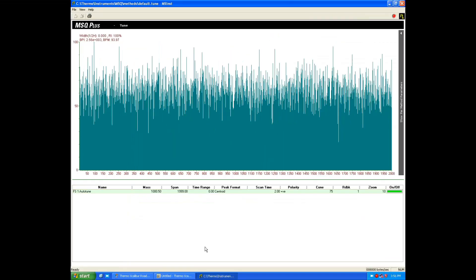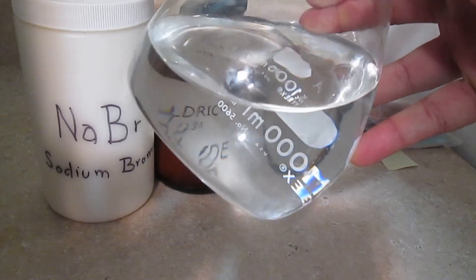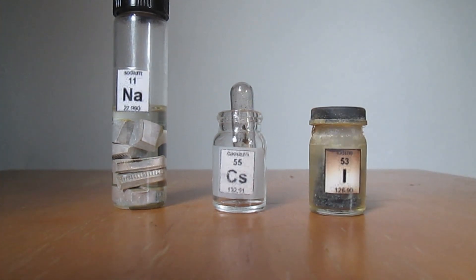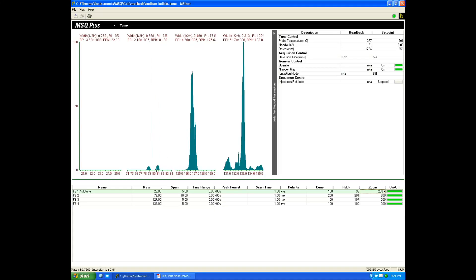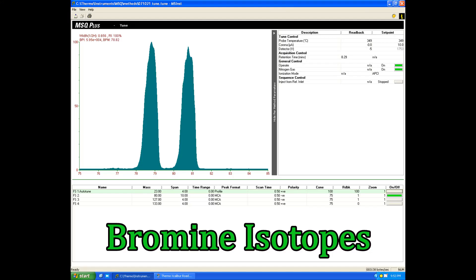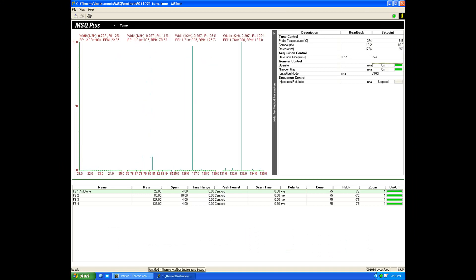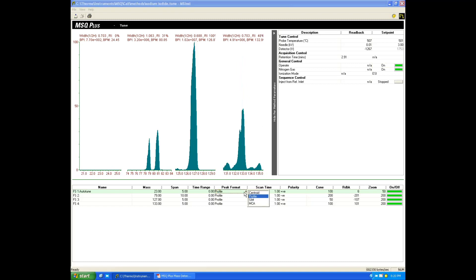Once turned on, warmed up, and after a stable vacuum was established, I tried to tune it with a solution of sodium bromide and cesium iodide at 100 parts per billion. I used sodium, cesium, and iodide because of a wider mass range and because they contain only one stable isotope. Bromine has two, which allowed me to fine tune and observe the isotopic ratio and the power of separation of this instrument. I am really surprised how accurate and how well this thing performs. For an older used spectrometer found on eBay and shipped by truck from across the country, these first results are very encouraging and I'm very satisfied.